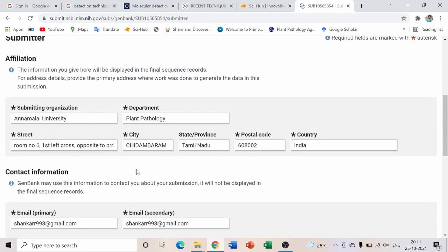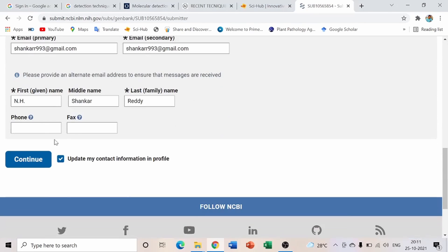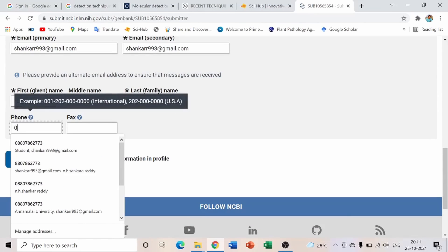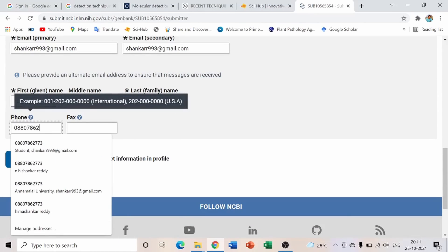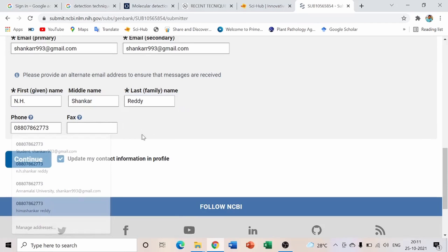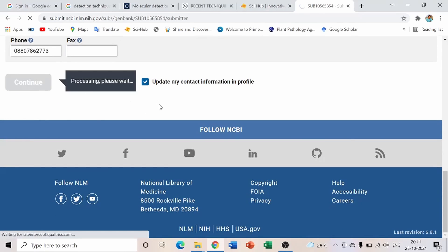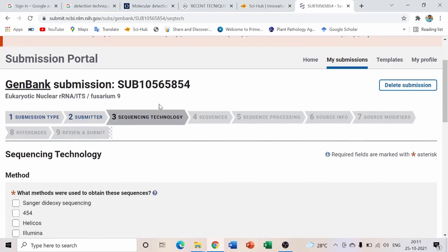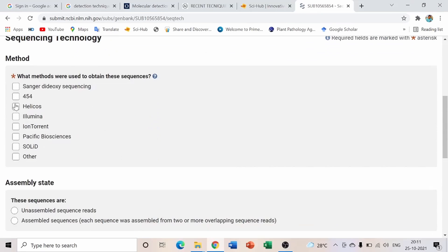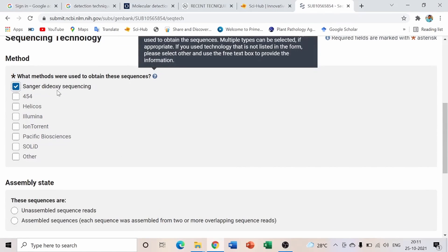The second step is Submitter. My data already appears here since I previously filled it in. The only thing you need to add is your phone number. Once added, click Submit. Then move on to sequencing technology — select 'Sanger Dideoxy Sequencing,' which is the most commonly used technology today.